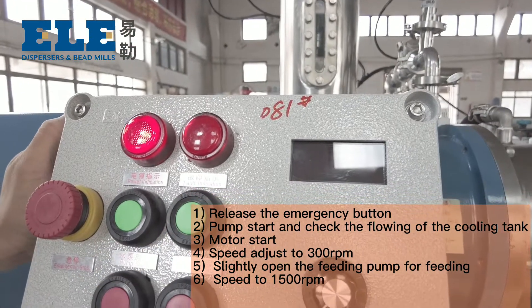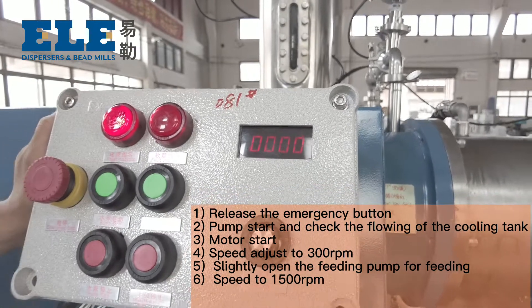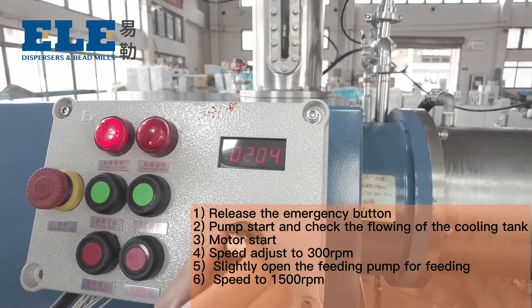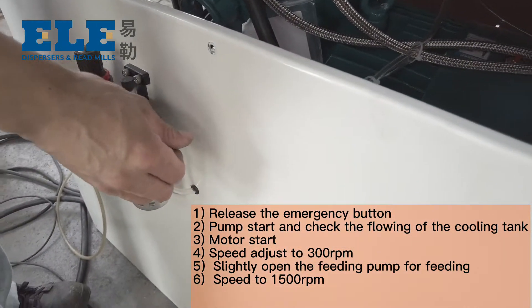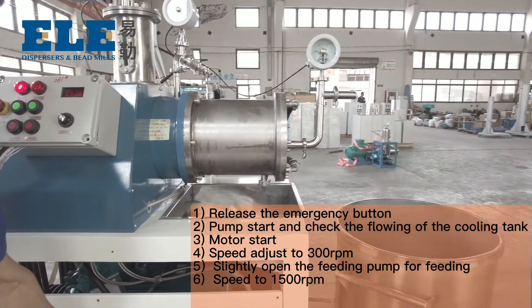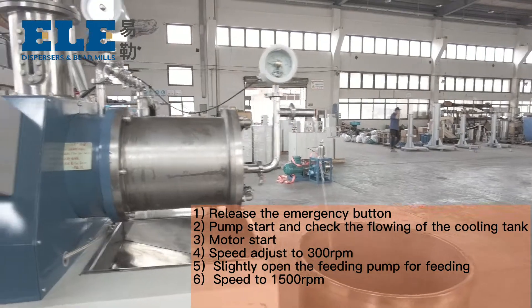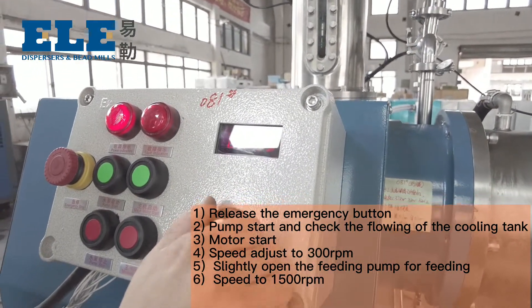Motor start. Adjust speed to around 300 RPM. Slightly open the feeding pump for feeding, until you can see the material outflow from the discharge port. Then speed up to the maximum — 1500 RPM.